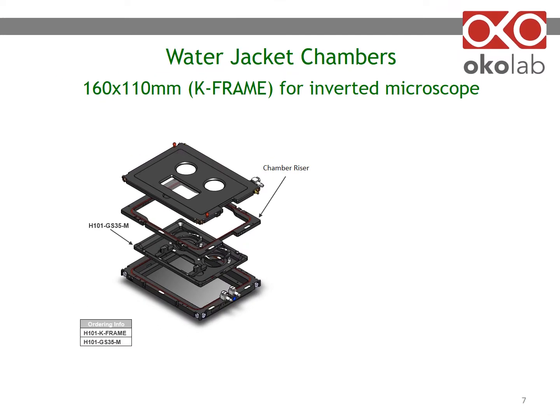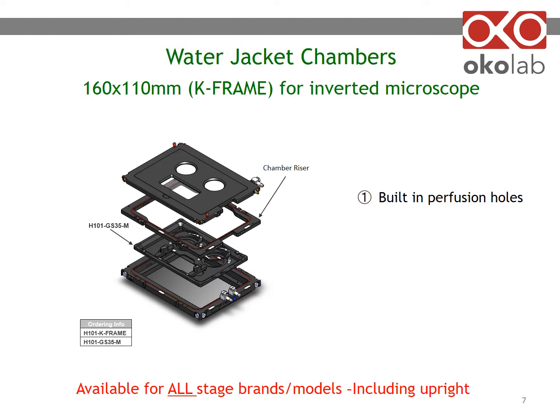To illustrate the water jacket chamber, I will use a K-frame for inverted microscopes. It fits a microscope stage with an opening of 160 by 110 millimeters. Please note that chambers for all stage brands and models including upright are available. OcoLab K-frame chambers have built-in perfusion holes plugged with small screws.